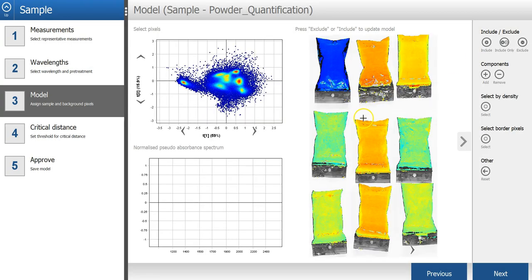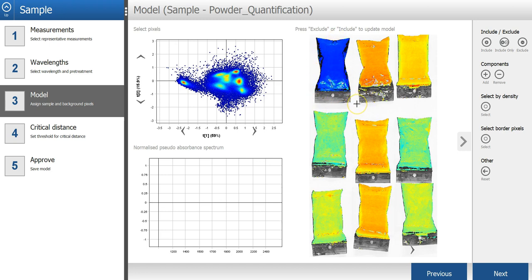And I can see that all the background pixels have been excluded, and also that it updates the PCA model.